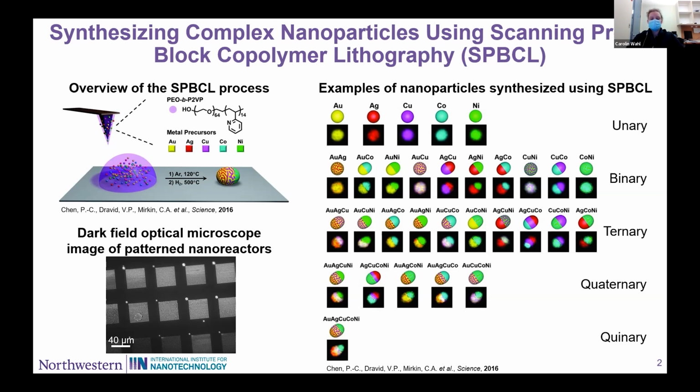So we're really interested in figuring out what the crystal structures and orientations are, and what those interfacial regions look like inside of those complex particles. Perhaps the simplest way of looking at crystal structure on the nanoscale is using FFT of atomic resolution images.